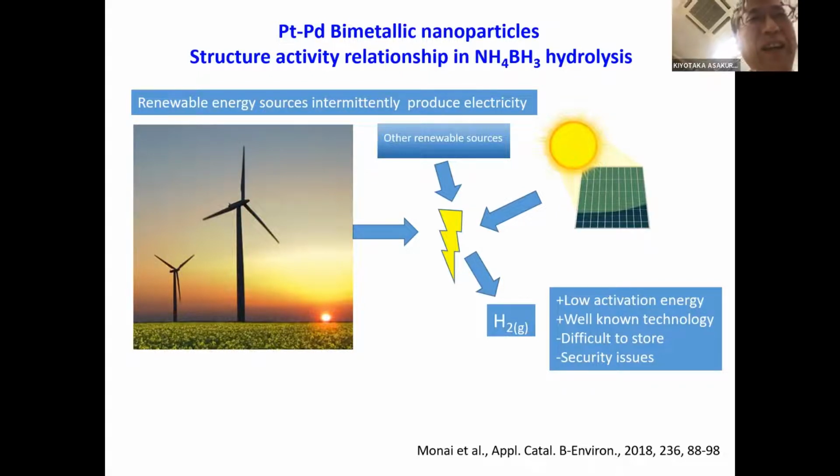So I think that we will go to a toroidal mirror in the near future, when we get the money for that. And on the same question, a sagittal bender means you bend the crystal. You stress it, you are not in perfect conditions, you lose some flux, actually. With respect to the formulas and calculation, you lose some flux because you bend it. It's never perfect. So when you go to higher energy, you lose too much. You lose with a toroidal mirror too, but in principle less, and you have a perfectly stable movement. Like a monochromator with many motors, there is no debate.